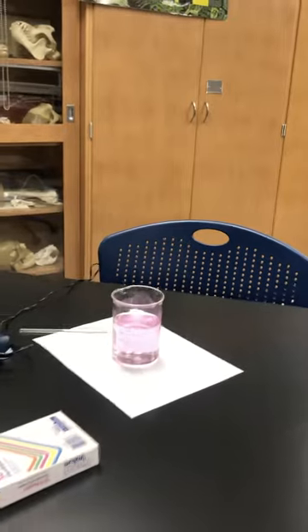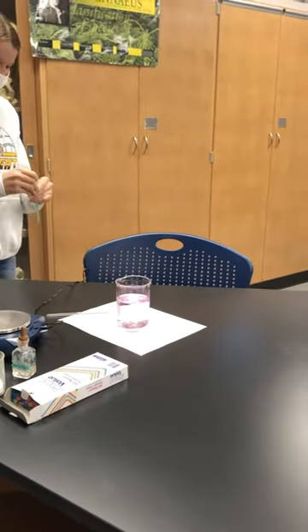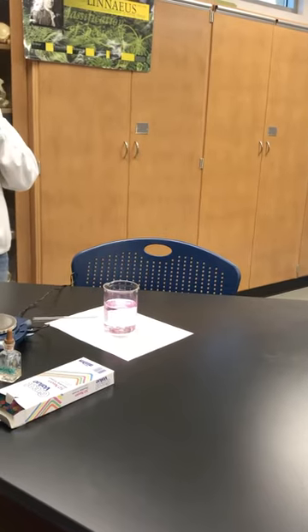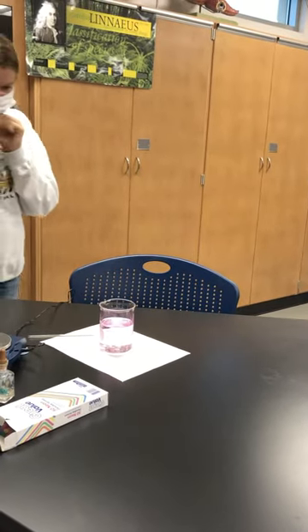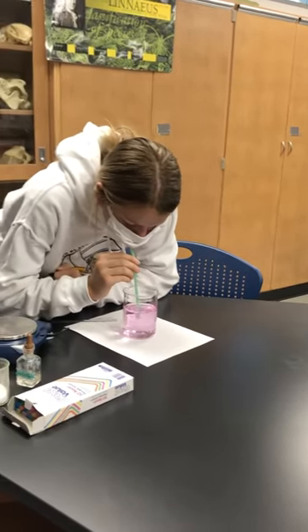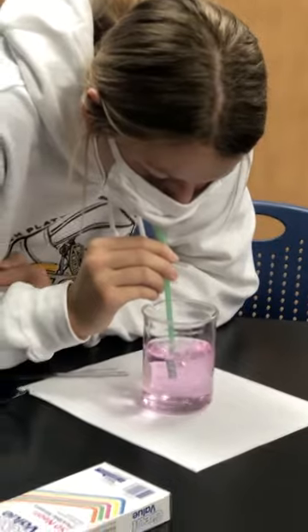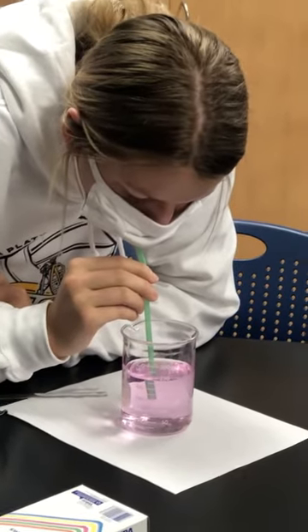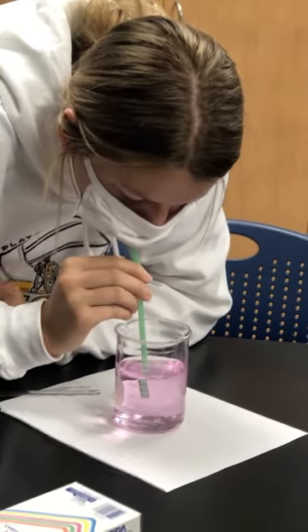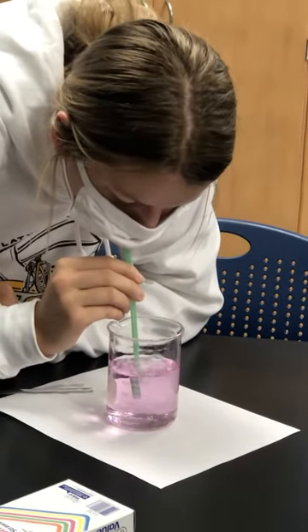Now what Allison is going to do, and I'm going to step back just a little bit, is exhale or expire carbon dioxide from her mouth into that solution. So that's what she's doing right now. She's just simply blowing or exhaling carbon dioxide into that basic water baking soda solution.